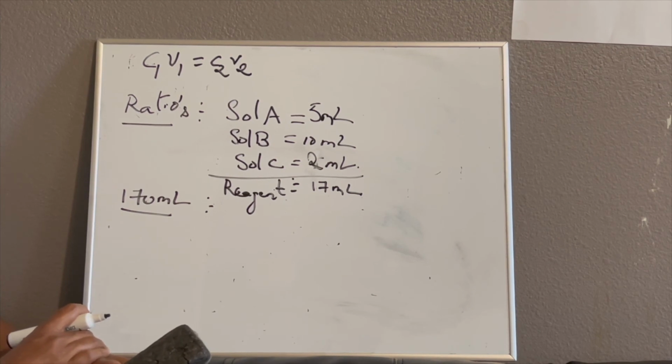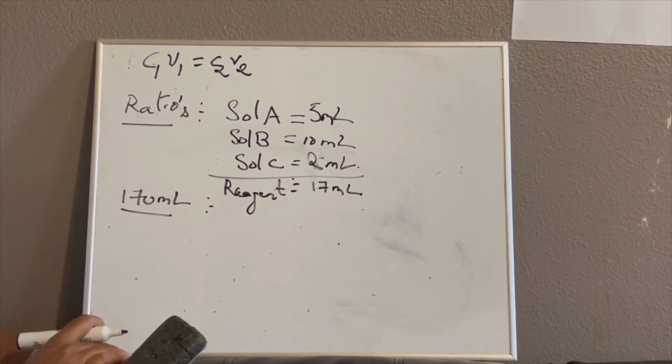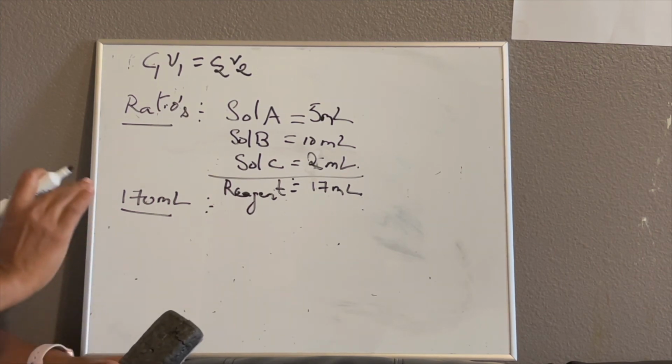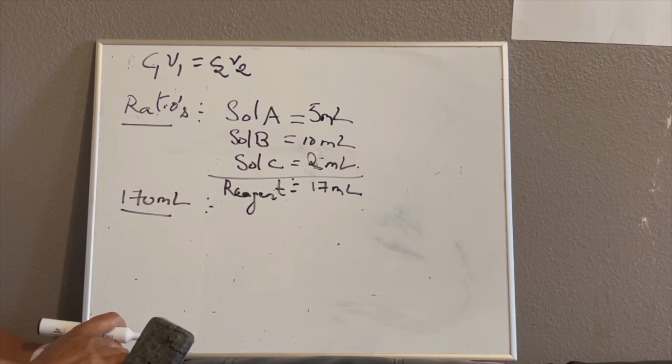And coming to your reagents, all the reagents you need for your assays, we used to have a practice where we check the inventory and see which reagents are going low, and we need to maintain the inventory sufficient for at least a couple of months, because I went through situations where the reagent I needed got back ordered, and it affected our work. So it's always important to maintain the inventory of the reagents, at least enough for a couple of months, depending upon your workflow.